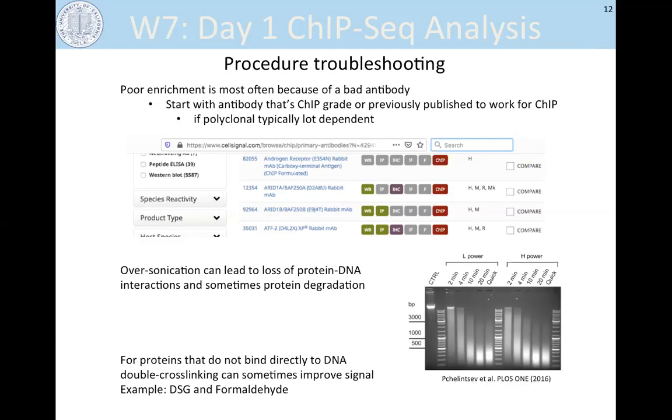So are you referring to it as an alternative to cross-linking? Because there's something called native ChIP where you don't cross-link and you use MNase, or cross-linking and then MNase digestion. Yeah, I was suggesting cross-linking and MNase digestion. I've actually done that before with RNA polymerase II ChIPs, but I wanted to hear your perspective.